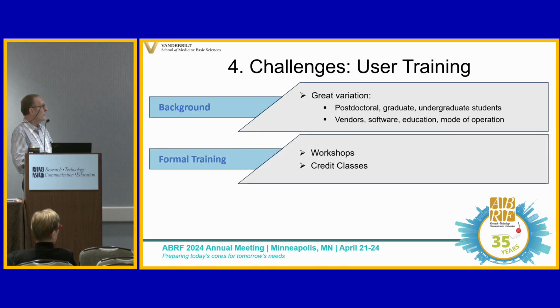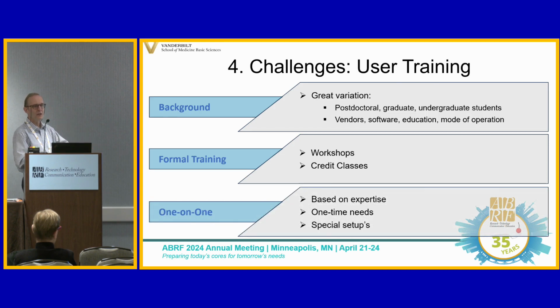We address them normally by forcing or asking the new students to attend a workshop where we really go through, first of all, administratively, how we are set up, how you can access our facility, but then also explain how they can measure a spectrum easily. So it's kind of an introduction that helps them to really utilize the instrumentation. There are also credit classes that we offer at Vanderbilt that they can take to get their theoretical knowledge, because these workshops really focus on the practical aspects. Usually that's not enough.